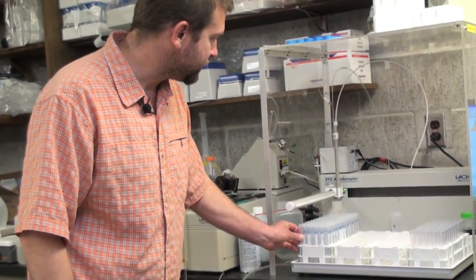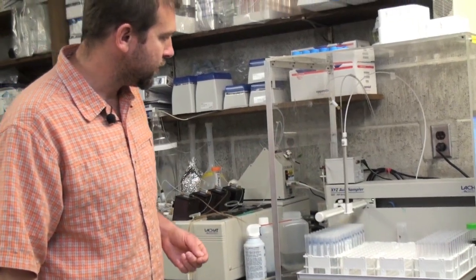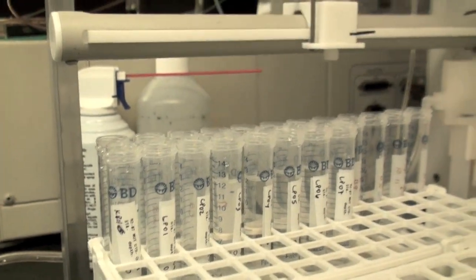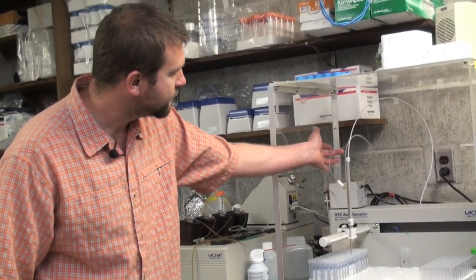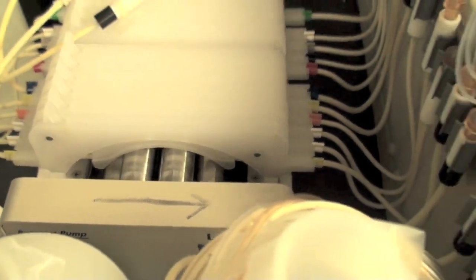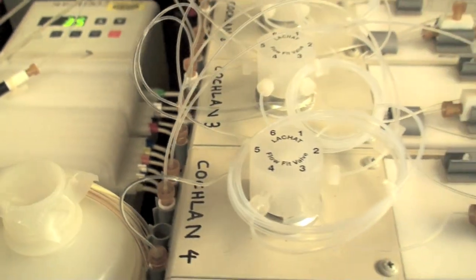Put the sample on this rack, the robotic auto sampler will come over and it will pick up a small amount of the sample and it will push it through these lines all the way through this pump and as the water sample is loaded onto these channels.